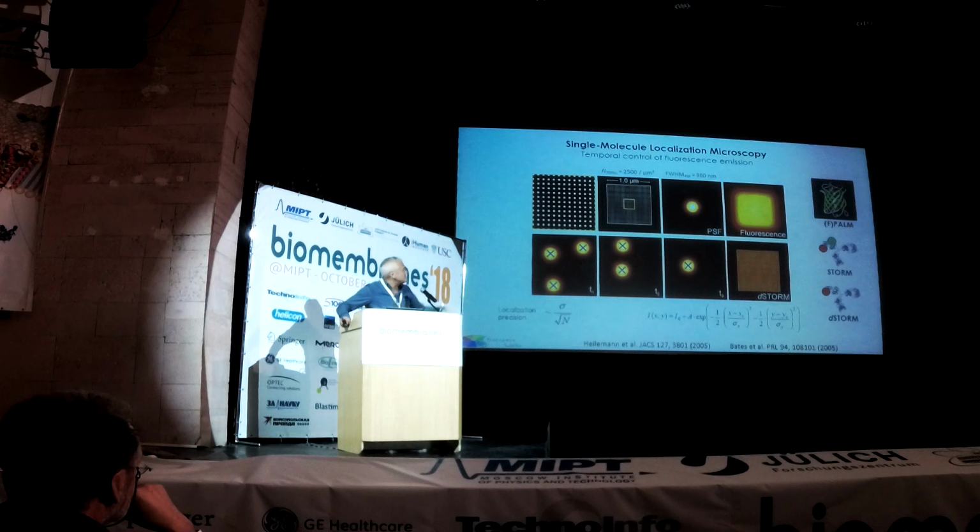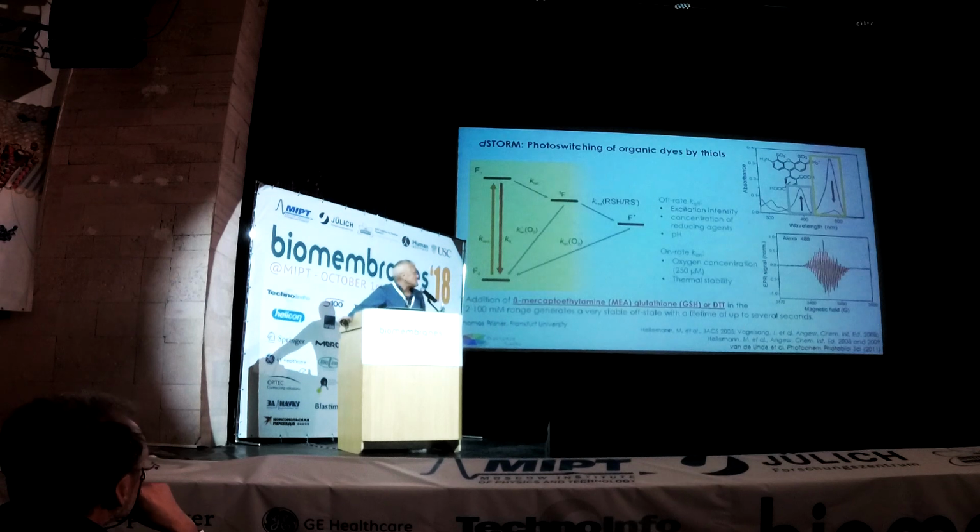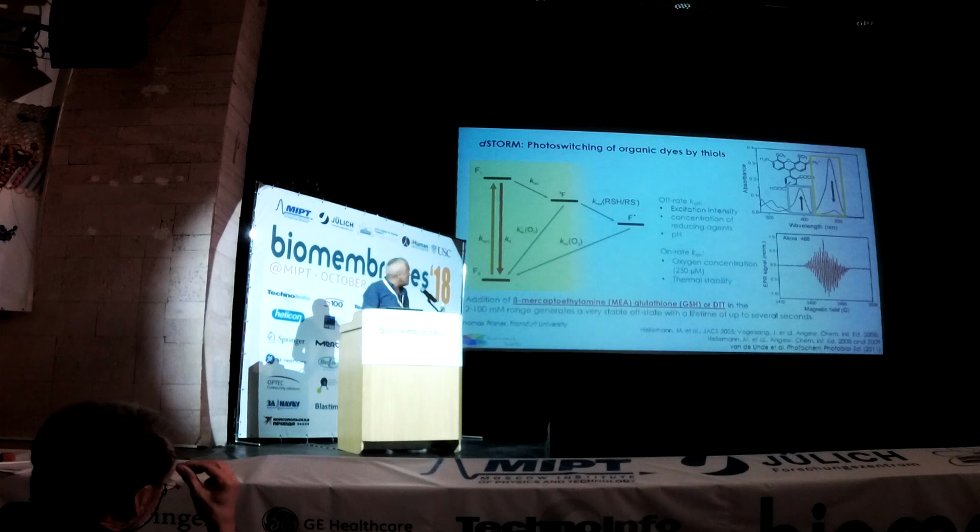The only difference between the two papers was that in the PRL paper it was claimed that you need an activator and a reporter dye, so a pair of fluorophores. We published that it works for any dye, so you can simply buy your antibody labeled with a fluorophore, add this buffer, and do super-resolution microscopy. Then in the following years we investigated in detail the switching mechanisms. I will not go into detail today because then I would run out of time.